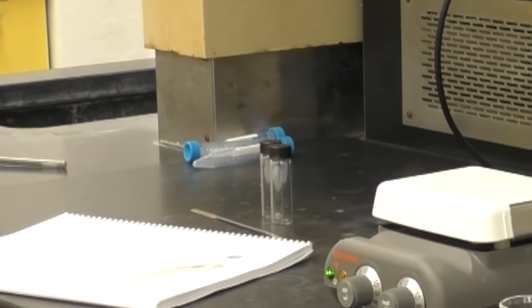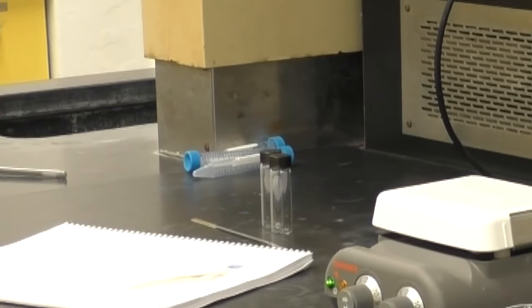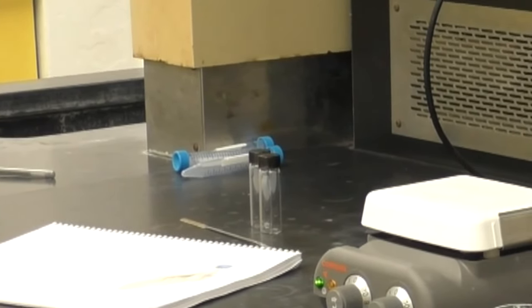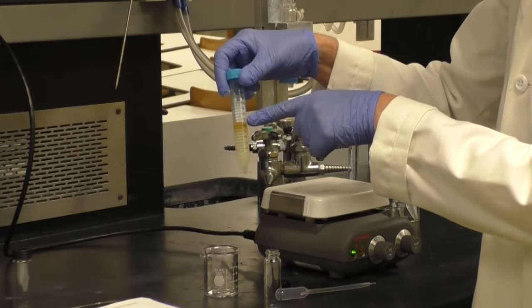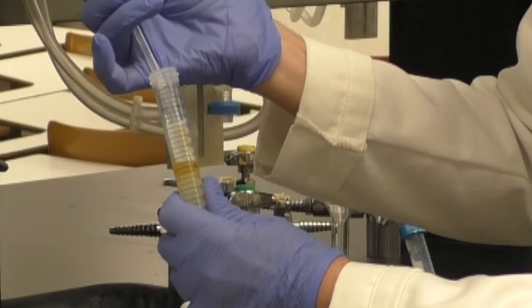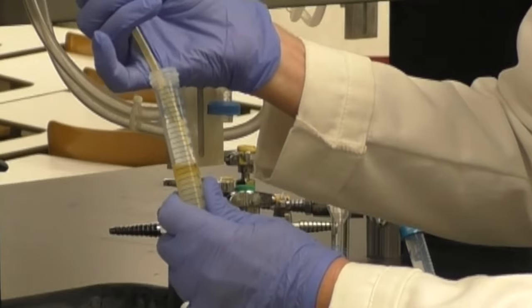While the layers are separating, pre-weigh a clean 4-dram vial and record the weight in your lab manual. Once the solution is separated, carefully remove the top layer which is the eugenol and place it in your vial.